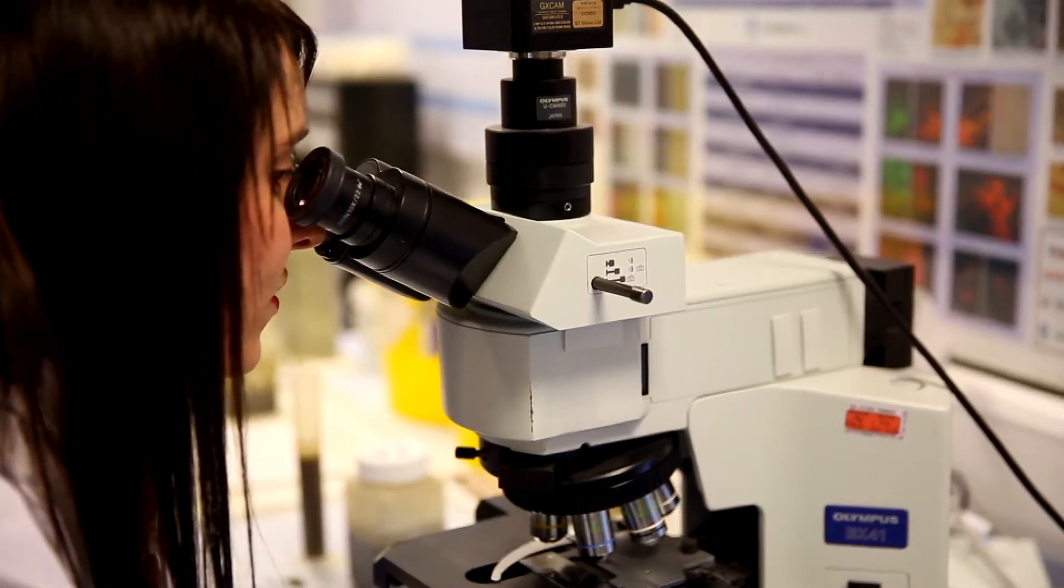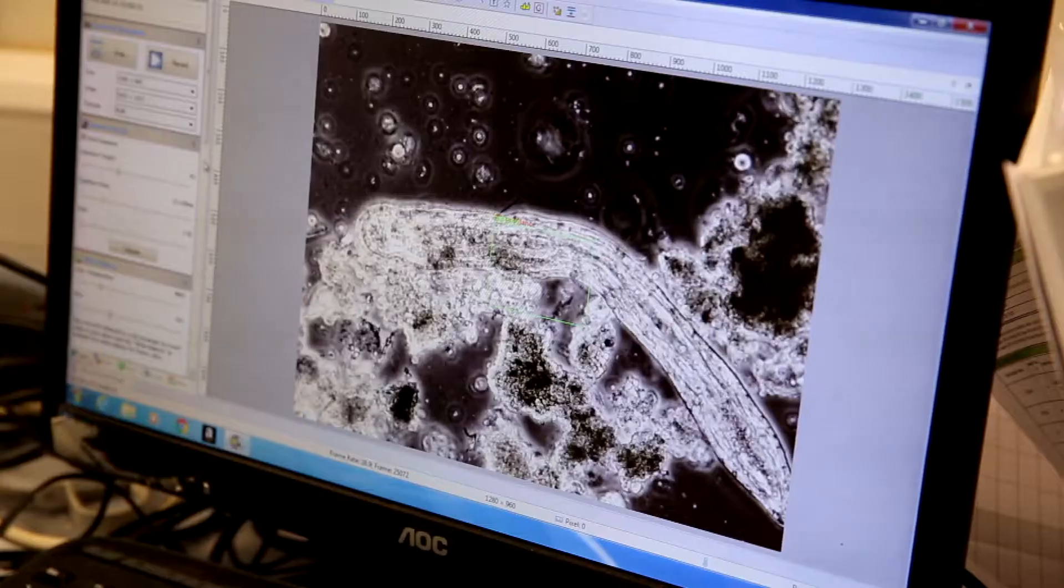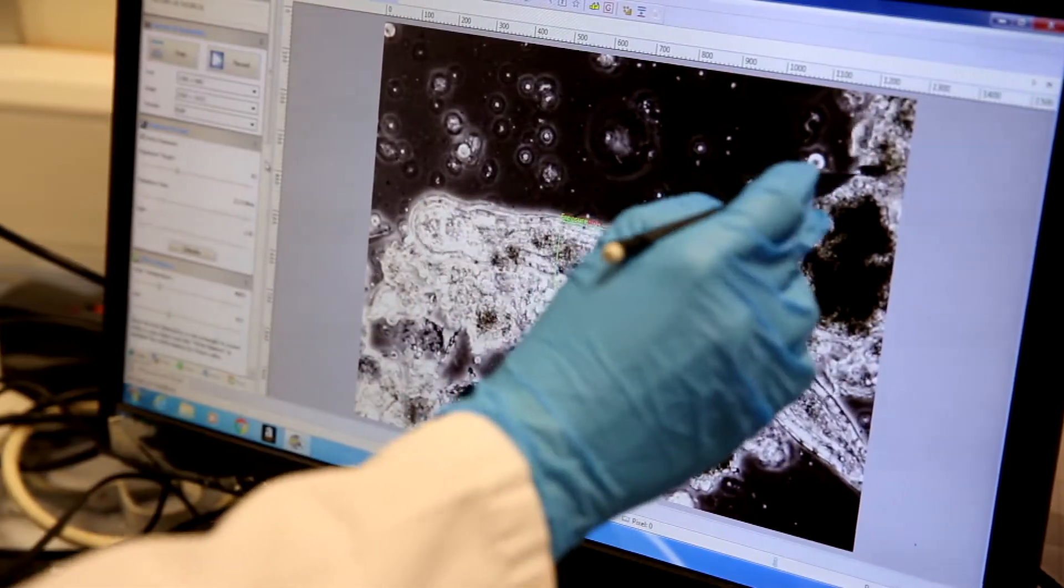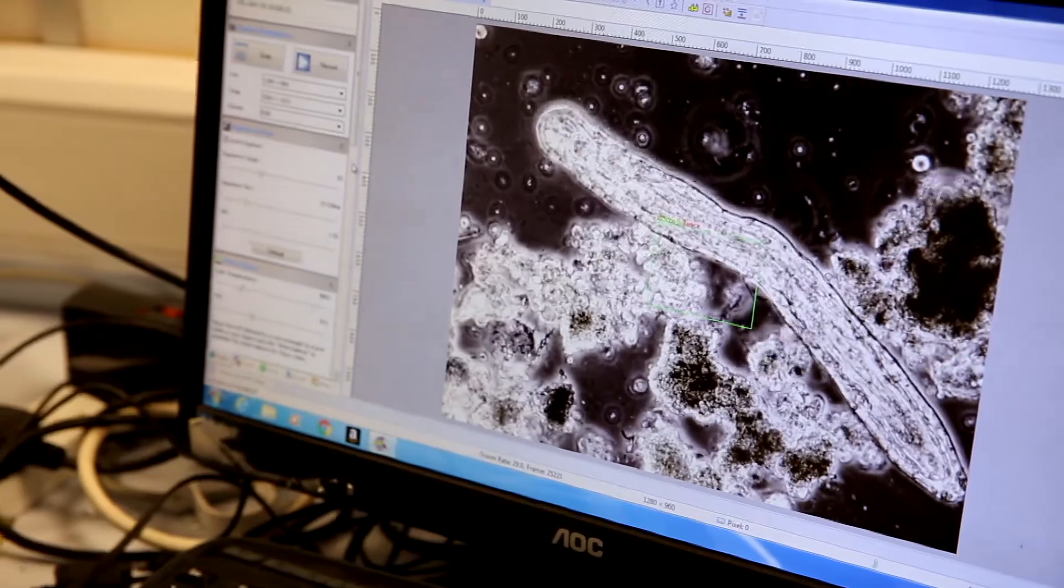Looking down the microscope is important, especially in identifying different indicator organisms which tell us how a plant is feeling and what actions we could take to improve its performance.